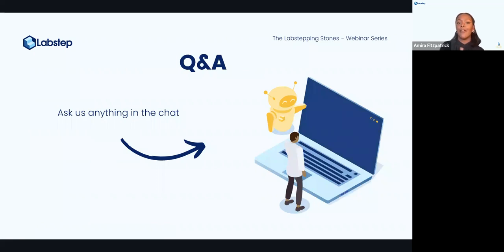Ethan, read out what we've got. Yeah, we've got a few here. So is there a way to update the experiment template using API? Yes, for sure. So you can set up new experiment templates using the API if you want to. That's no problem at all. You can run that within a Jupyter Notebook, or you can access the API locally, both of which work.